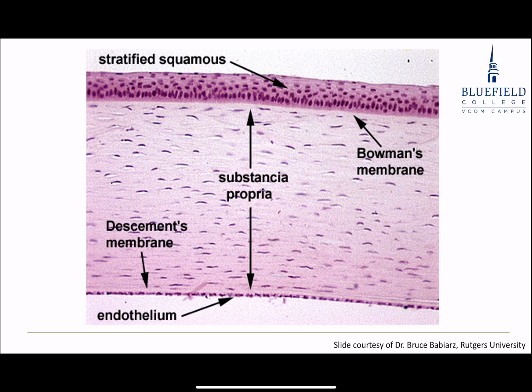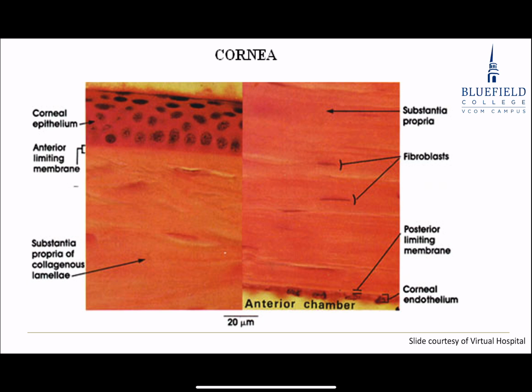All right, higher power magnification. Got the anterior surface and the posterior surface. Just had to get rid of a lot of the stroma to see it. But once again, here we see our corneal epithelium right here. Multiple cell layers thick, not a whole lot, but squamous on the surface.